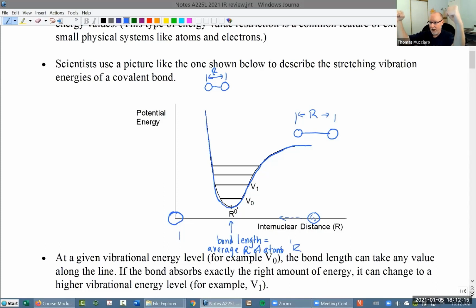They're moving from a wide distance to a narrow distance. That's what this graph is trying to show. Do you see? It's saying pick a potential energy level. That's the widest they're going to be. Now they start moving, they reach that point, then they move up until they stop moving at the other end of that curve, and then they move back. So they're moving back and forth. Everybody cool with that?